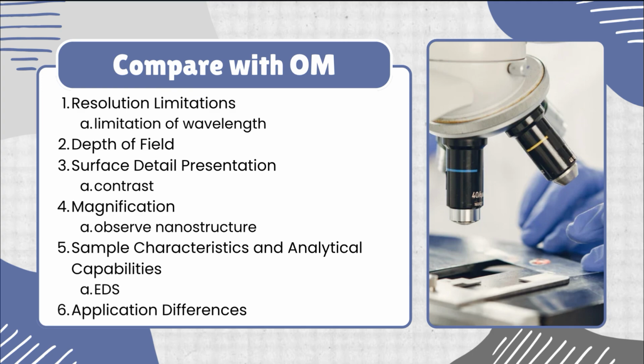And the final is application difference. OM is suitable for quick sample inspections of larger-scale samples or those with relatively rough surfaces. SEM is better for cases requiring high-resolution observation and detailed structural analysis, such as biological tissues, nanomaterials, or electronic components.